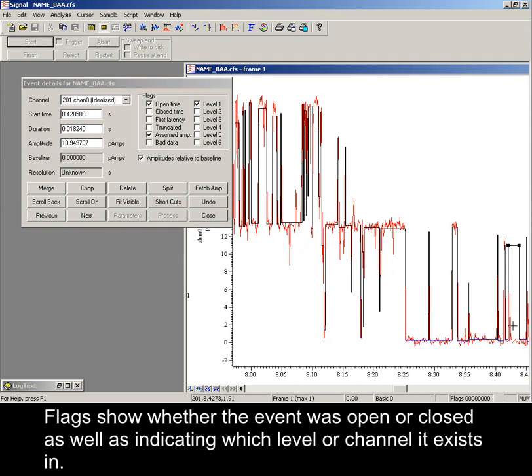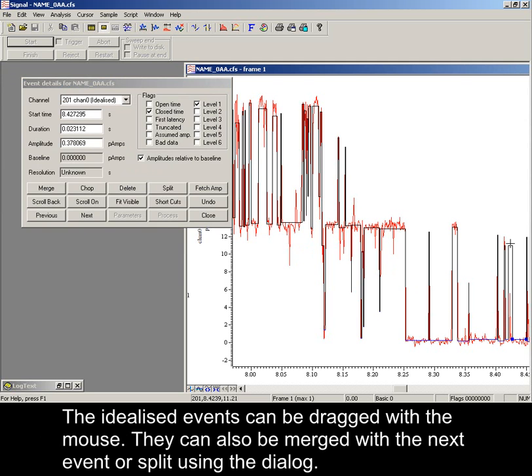Flags show whether the event was open or closed, as well as indicating which level, or channel, it exists in. The idealized events can be dragged with the mouse. They can also be merged with the next event, or split, using the dialog.